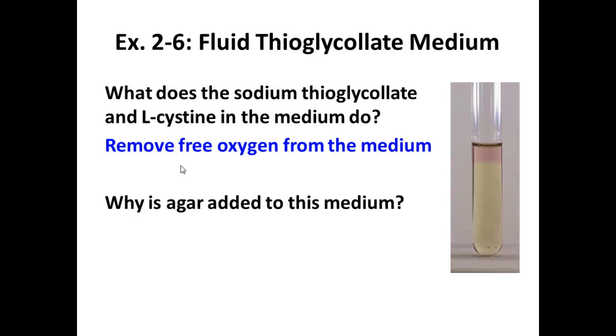But this is also why when I told you guys to inoculate, that you had to go all the way down and inoculate up through the media. The problem with that is I showed that like 2 or 3 times in the one that I was inoculating. So you guys were shaking like crazy and probably introduced more oxygen into your tubes than need be. So we'll talk about that when we look at our results a little bit later.